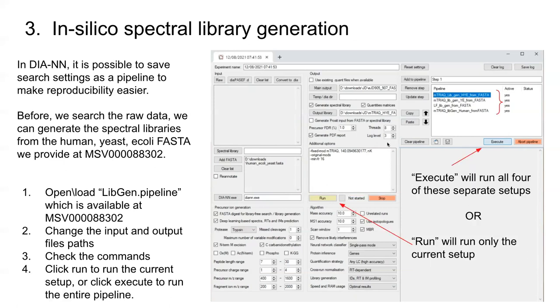Once all that's done, it should be ready to run. You could either click run, or if you wish to make all these different libraries yourself, you could go through all of them, change all the file paths, and click execute. It'll do this one first, then the next, then the next, and then you'll have four different libraries.